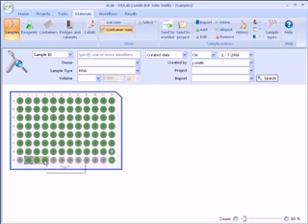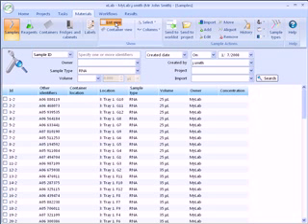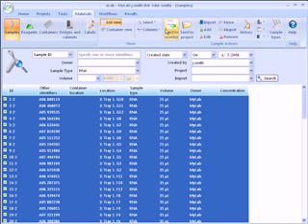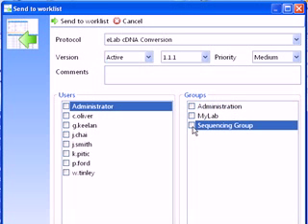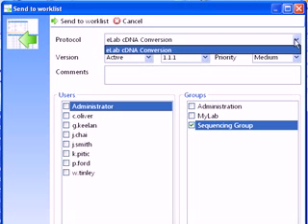To perform work on these samples, we either send them to a work list or a project. Select the samples and then click on the send to work list button. Select the users and or groups who will see the samples in their list of work to do. Choose from the list of protocols appropriate for the sample type selected. In this case, cDNA conversion is the only valid protocol in the database for RNA samples.